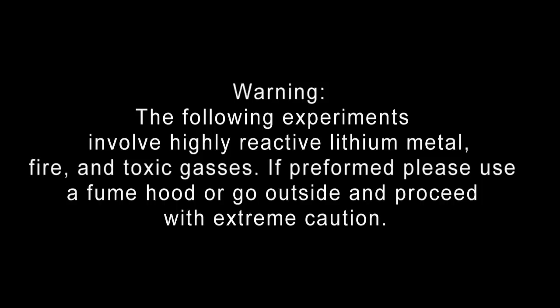Warning: the following experiment involves highly reactive lithium metal, fire, and toxic gases. If performed, please use a fume hood or go outside and proceed with extreme caution.